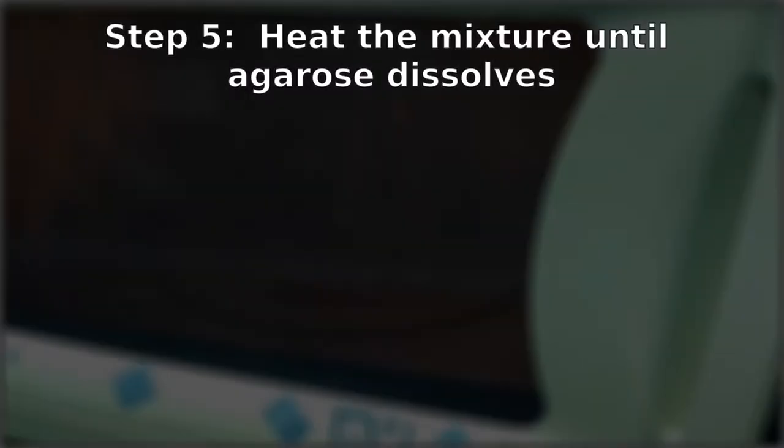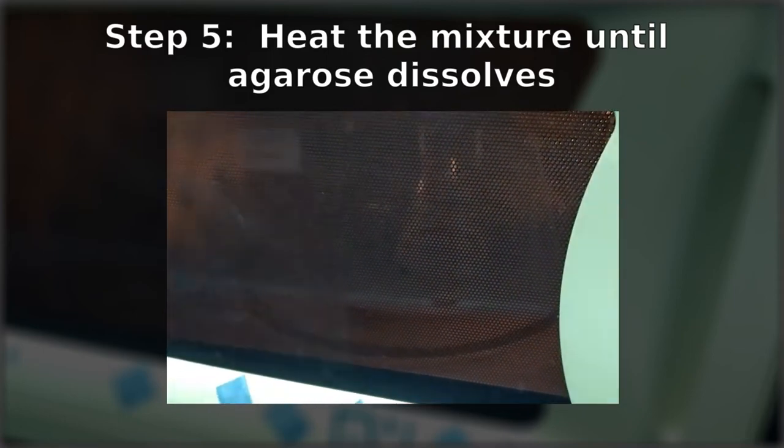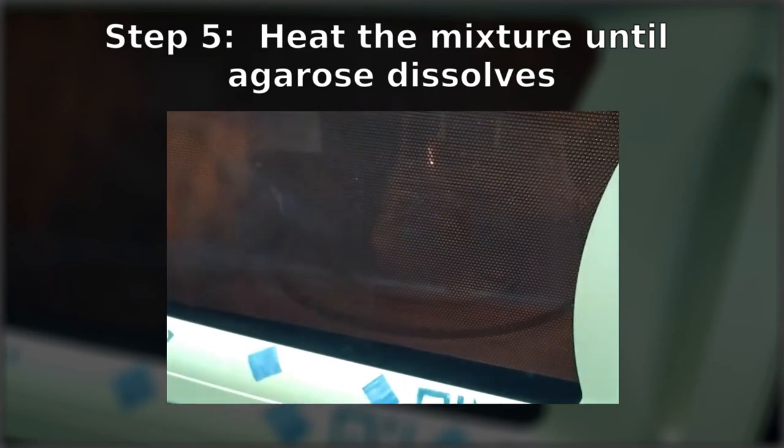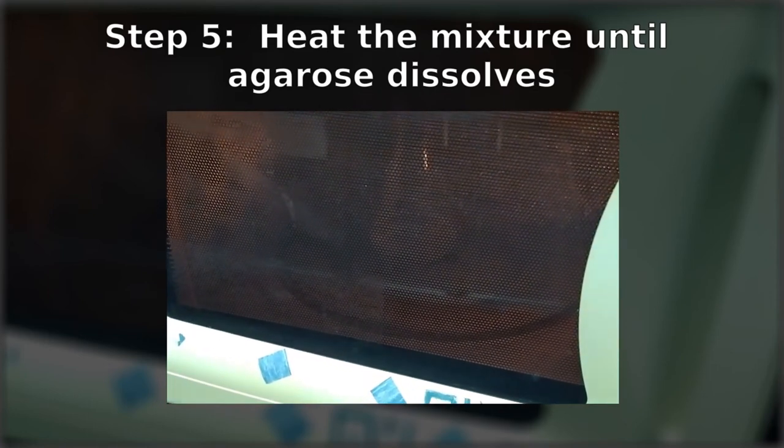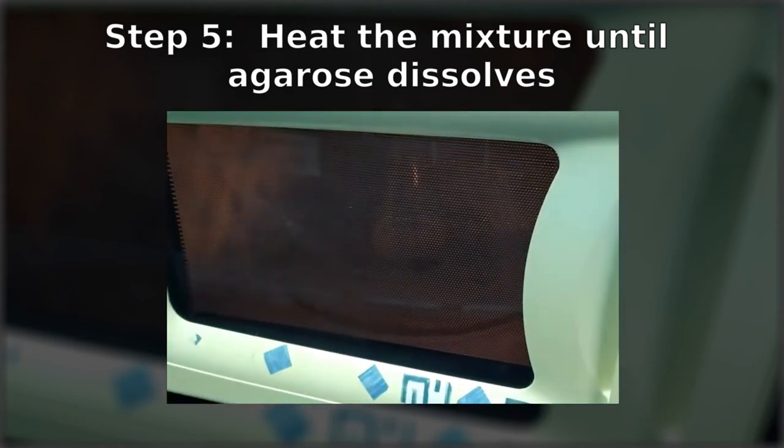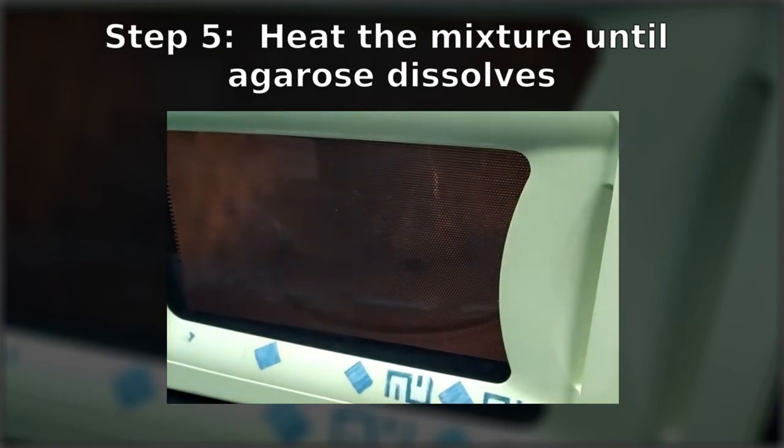Now, agarose does not dissolve in the buffer on its own. It has to be heated. So, this is where we throw it into the microwave. And depending on the power of the microwave, you're going to set it to either a minute or two. Usually, about a minute is probably enough. You want it to get just hot enough to just before it starts boiling. So, you want to be watching it carefully to make sure it doesn't boil over. As soon as you see it bubbling, stop the microwave.